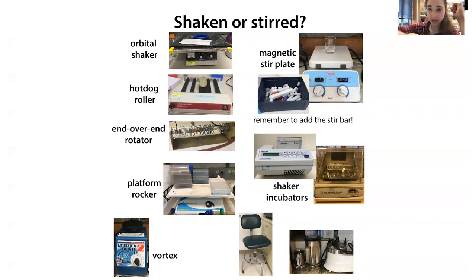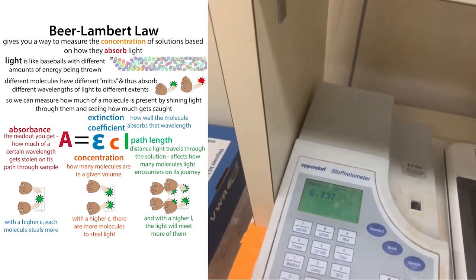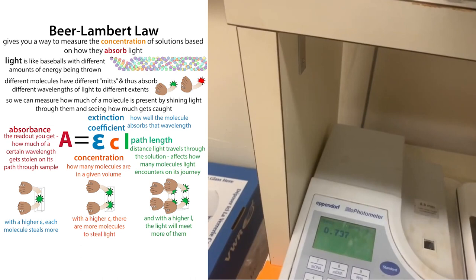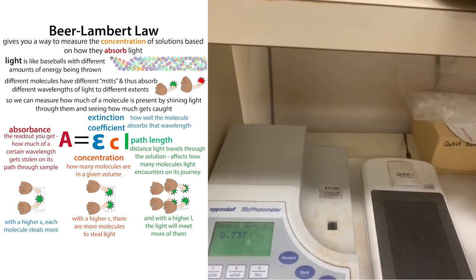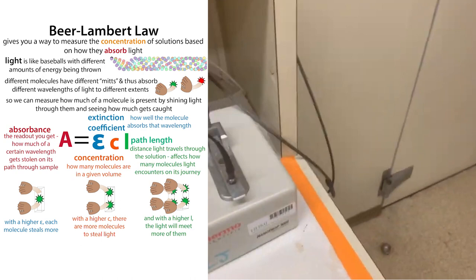This is a spectrophotometer — you stick your cuvette in and it measures how much light passes through at different wavelengths. You can use it for Bradford assays to get protein concentrations, or to measure bacterial cell growth. This is a NanoDrop, which is a similar type of thing but uses a tiny drop, so you don't use as much sample.